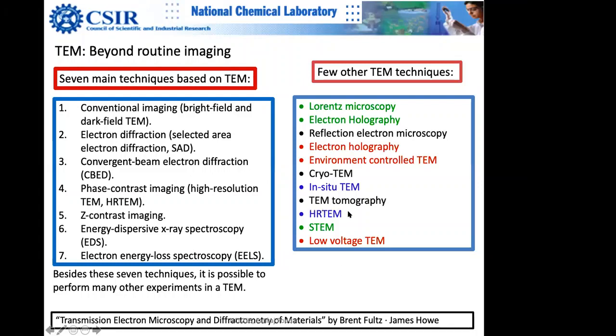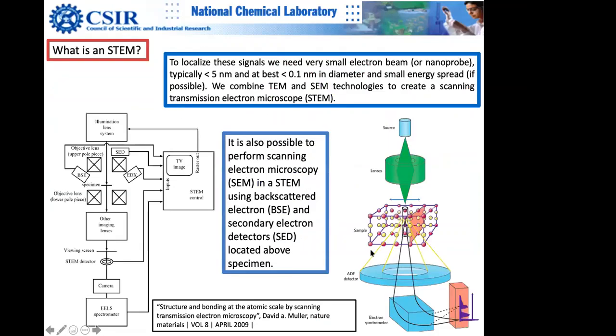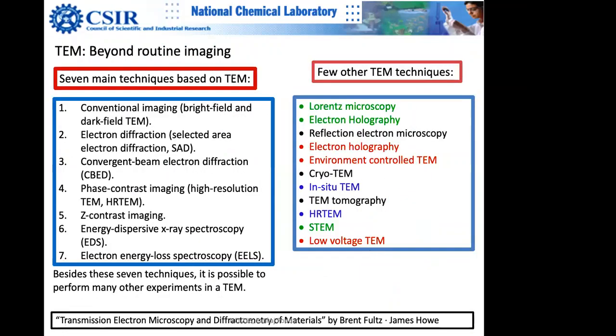Tomography, you are aware of, it's mostly used for soft matter, for example proteins. This Nobel Prize basically was mostly for using this TEM tomography. Anyway, I would like to end here because there is no end to that. As I told you, it's a large subject, and let us focus on the questions.